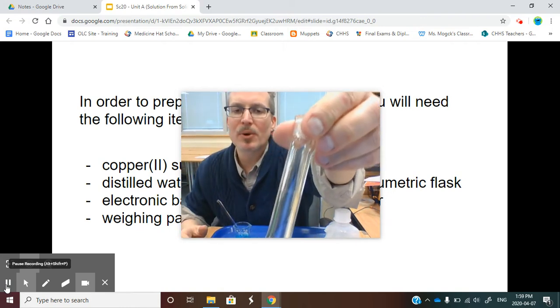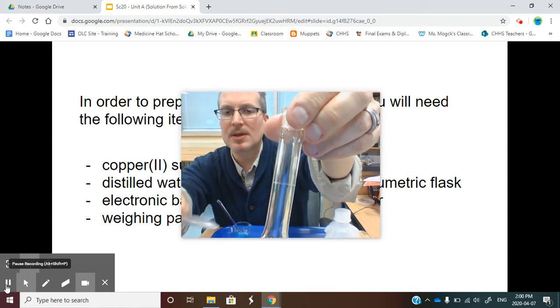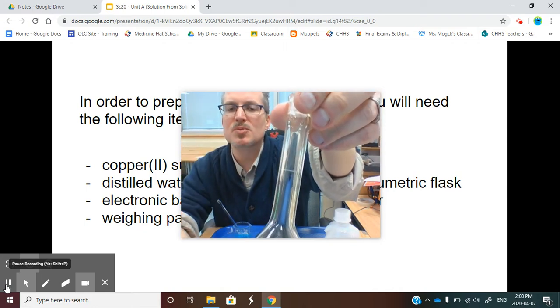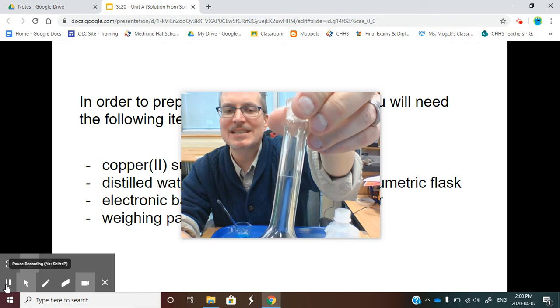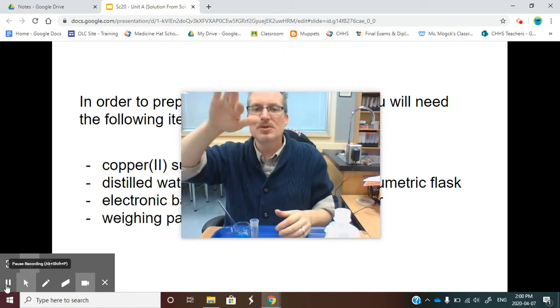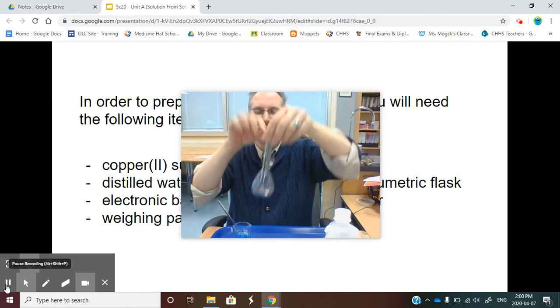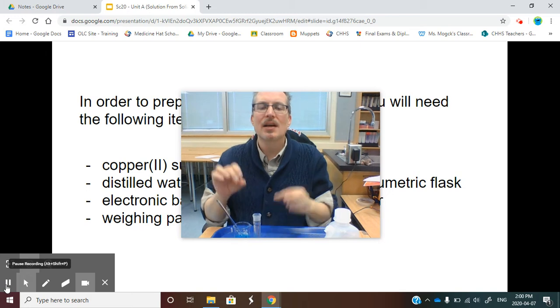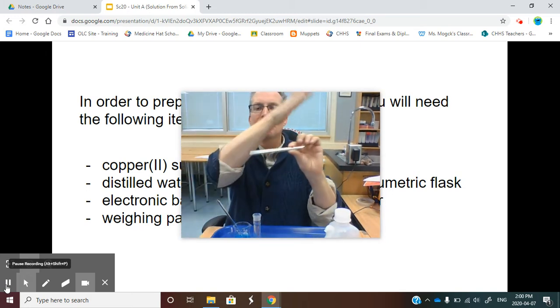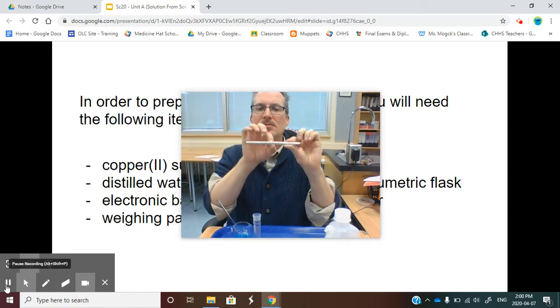Now, the one thing I want to point out is, on a 100 milliliter volumetric flask, there is only one spot where there's a line. This only measures 100 mils, and it measures precisely because it's got a skinny neck. And on this neck, there's going to be a swoop, and this dip we want to touch just barely on that line. That is called a meniscus, and we want the bottom of our meniscus on the calibration line. Anything below, not accurate.